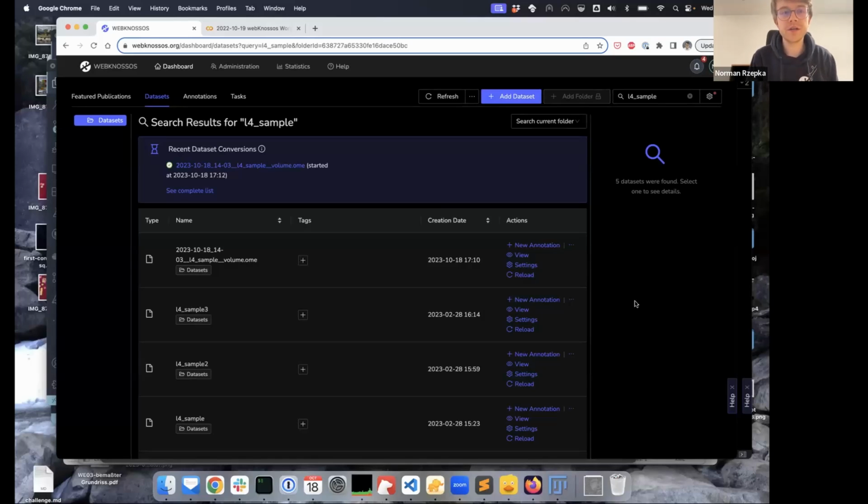I hope you've seen in the workshop description that you can get yourself a free account on webknossos.org, and that could be quite helpful for this workshop, because then you can follow along and do stuff as I show it. If you want to do it later on, that's also fine.